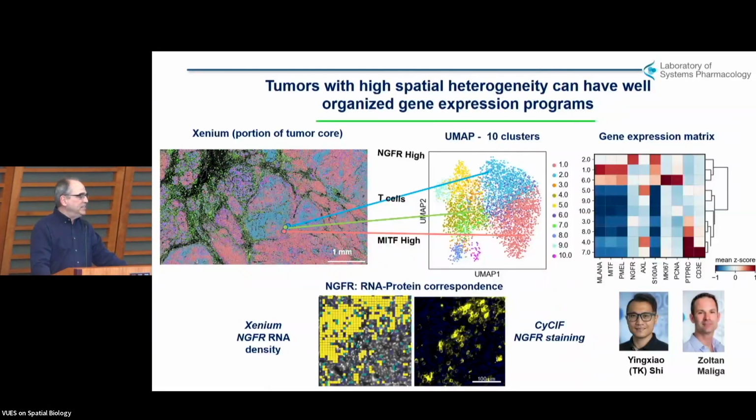But if we now go into the Xenium data, the left is a clustering done on the gene expression. I'm sort of skipping along here, and there's a UMAP on the gene expression profile. And we can say that those differences between yellow, green, and blue and red there are sort of significant with respect to gene expression profiling, GSEA profiles that are out there. What is remarkable, I think, is yes, this heterogeneous tumor that I'm talking about is in fact organized in terms of gene expression space if we took all the cells and ground them up and threw them in a tube. But cells that come from different parts of gene expression state are in fact neighbors with each other, exactly as the protein data would show.